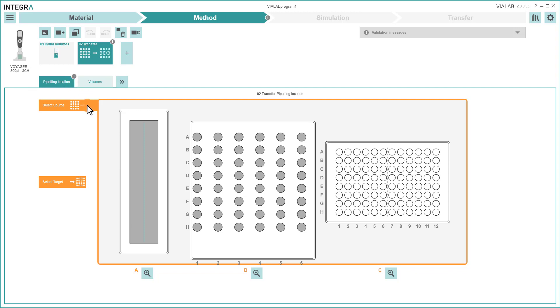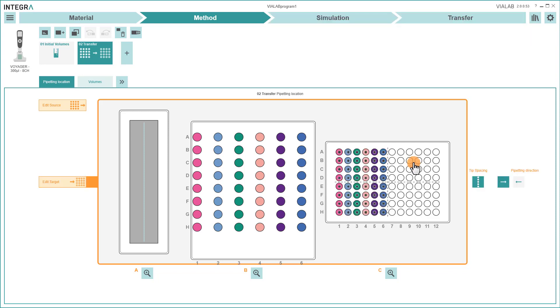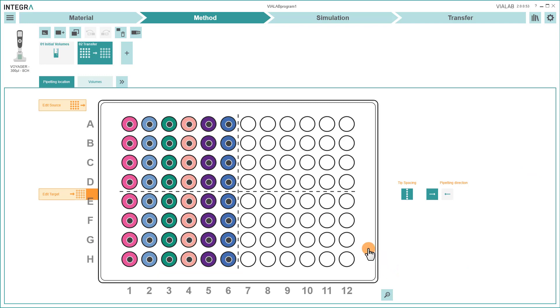Click on the button Source to select where to aspirate from. Click on the button Target to select where to dispense. Target wells are always indicated with a black graphic, for example a black spot.